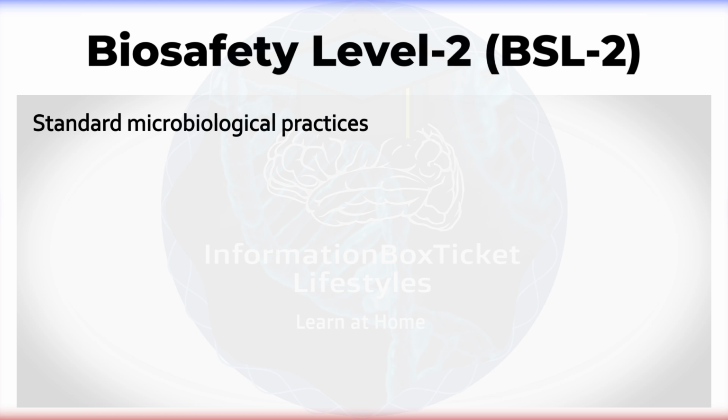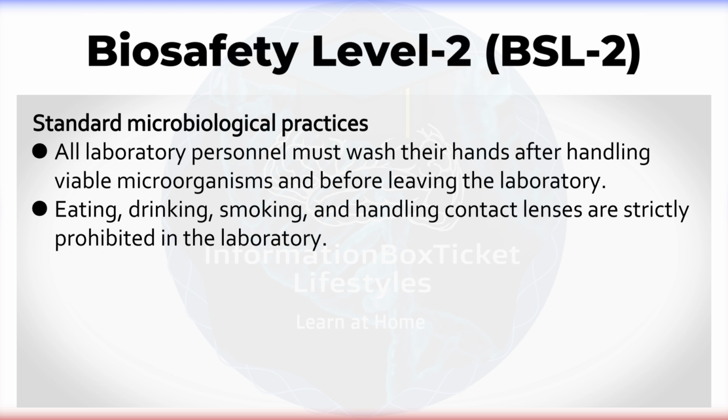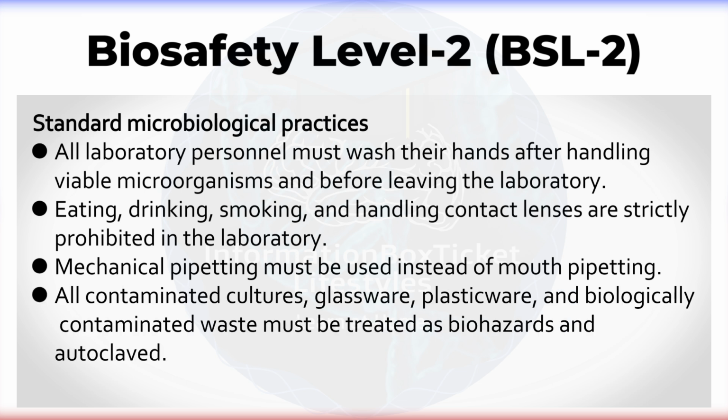Standard microbiological practices. All laboratory personnel must wash their hands after handling viable microorganisms and before leaving the laboratory. Eating, drinking, smoking, and handling contact lenses are strictly prohibited in the laboratory. Mechanical pipetting must be used instead of mouth pipetting. All contaminated cultures, glassware, plasticware, and biologically contaminated waste must be treated as biohazards and autoclaved.